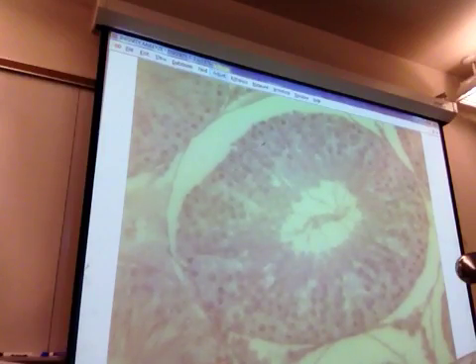And see how the cytoplasm here, you can see it really well because it's darker for the nurse cell. Yeah, that's obvious. I would point out several of these to you. I'm not going to outline the cytoplasm, but I'd say, here's a nuclei, and here's another one, and here would be another one. We'd be able to see it tracking down. You're basically going to have to outline that, versus something like this.